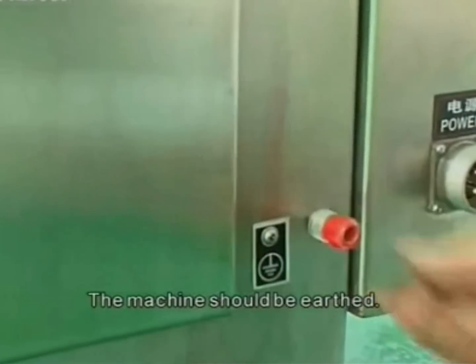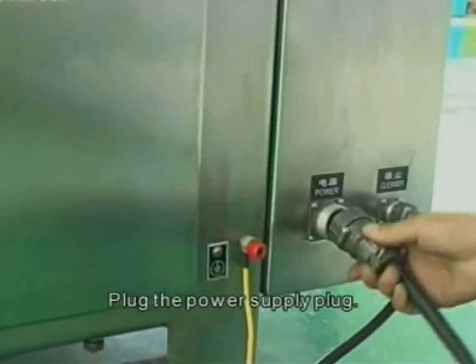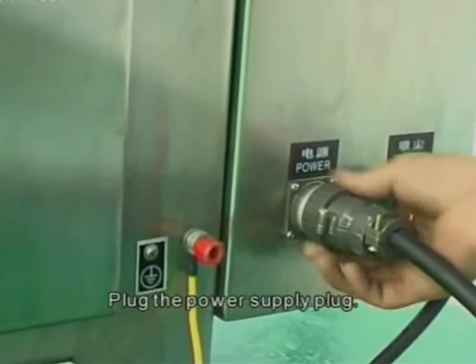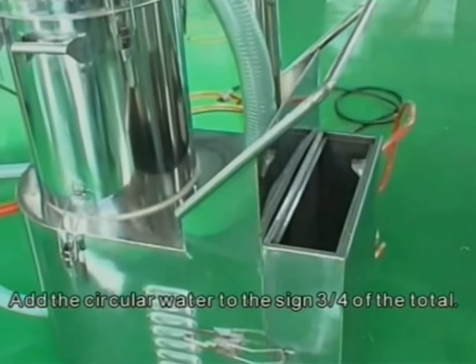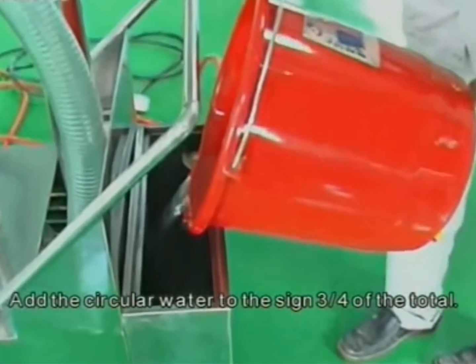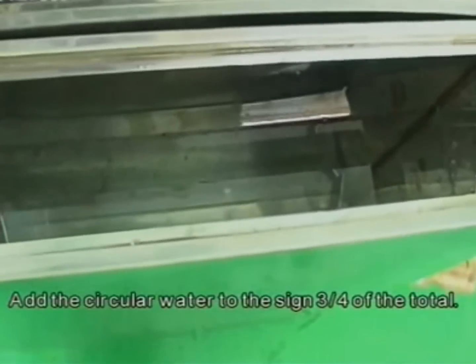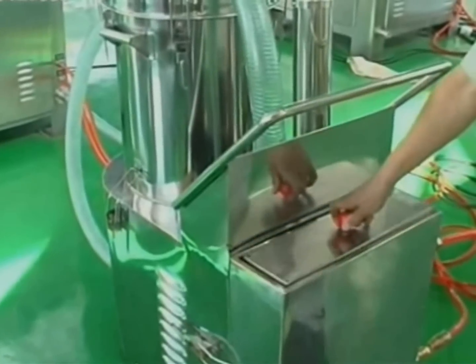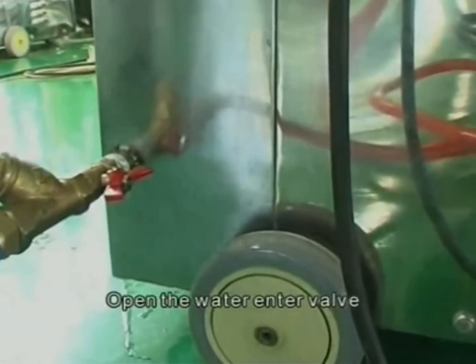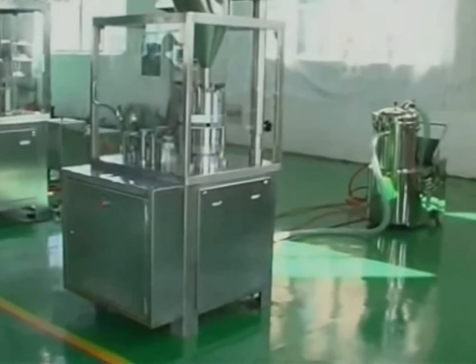The machine should be earthed. Plug in the power supply plug. Add circular water to the sign three-fourths of the total. Open the water inlet valve.